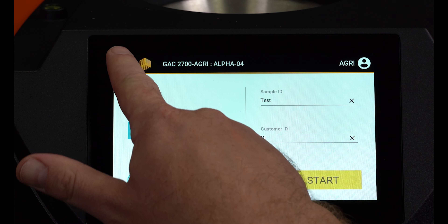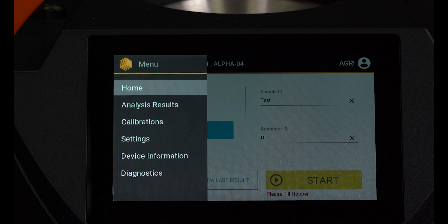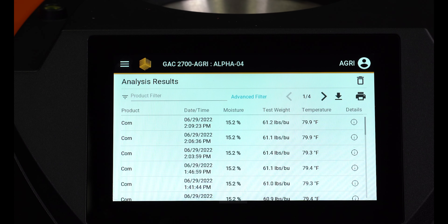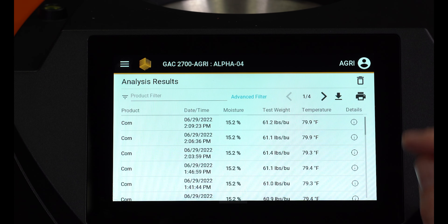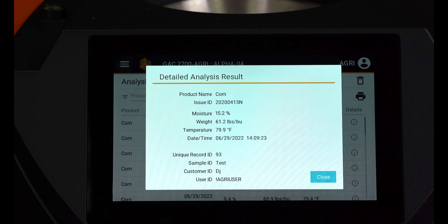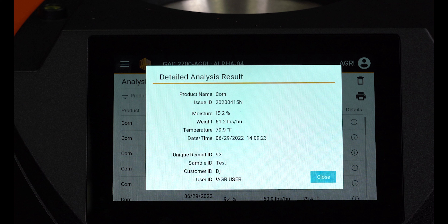The GAC 2700 AGRI is equipped with the memory to store 3,000 test results consisting of all parameters of the measurement. This includes the grain name, percent moisture, test weight, temperature, user ID, sample ID, time stamp, etc.